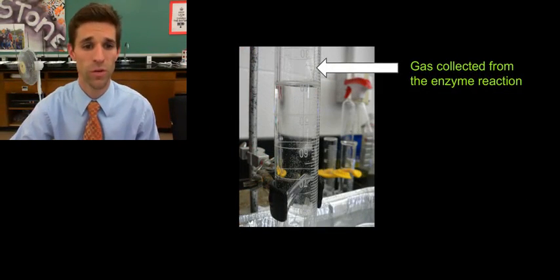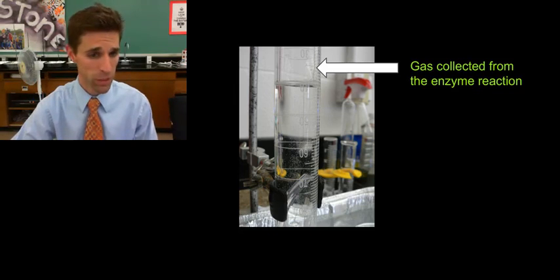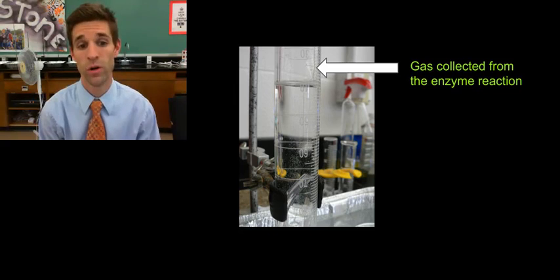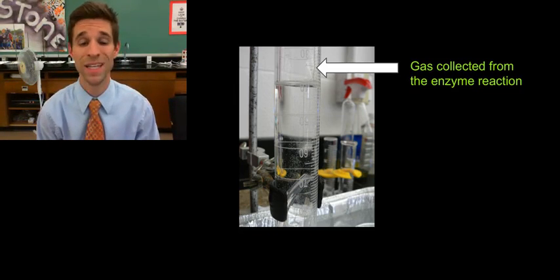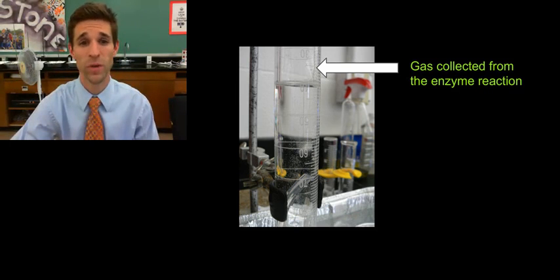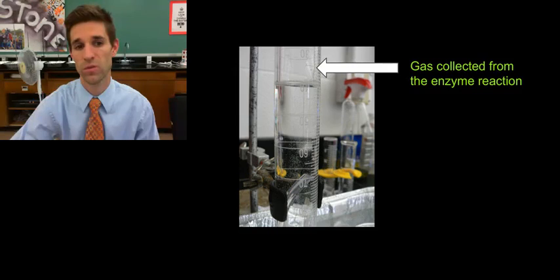So then here's another look, an up close look of the gas bubbling through the chamber, or through the gas collection chamber, and then displacing some of that water, and through the graduated marks on the side of the graduated cylinder, we can actually get milliliters of gas produced, and we can take a reading every 15 seconds for a couple of minutes to actually get a rate or a speed at which the gas is being produced.